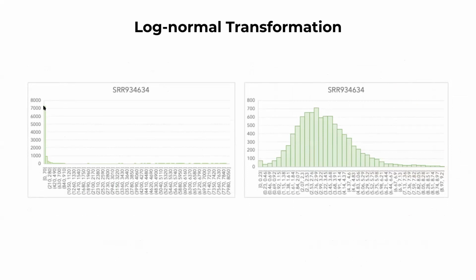So if you take all of your genes and all of their expression values and group them together in buckets in these different portions, you'll see that the bulk of your data is right here. And then a little bit less here, and then down here you barely have any, right? So because your data looks like this, all of your information is essentially in this first bucket.